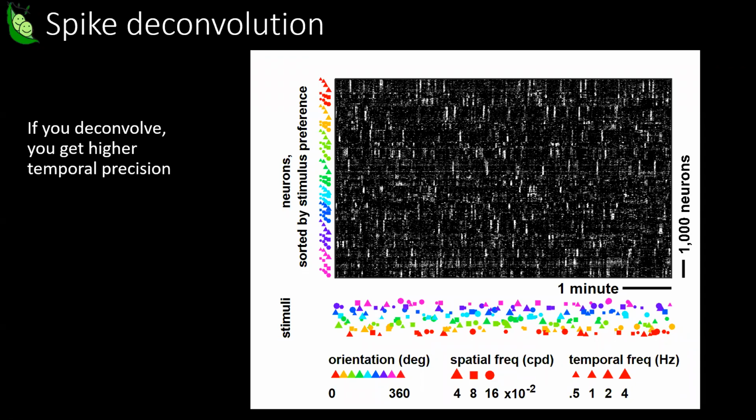Yeah, so that's pretty much all that I had. I think the points from this discussion about spike deconvolution are really important. It's really hard to know what a single spike is relative to the calcium signal across cells, and that can vary from cell to cell. So whenever you do these analyses, if you do decide to binarize your data or not, I wouldn't recommend it, but you can always look and say, what is my decoding accuracy if I binarize or I don't binarize, and these sorts of things.